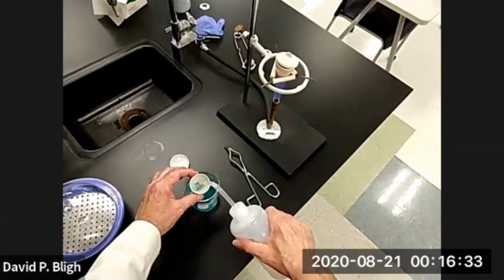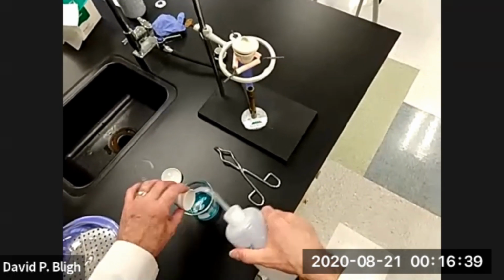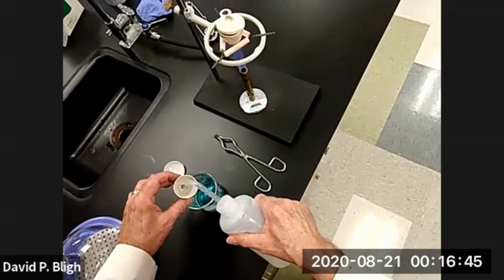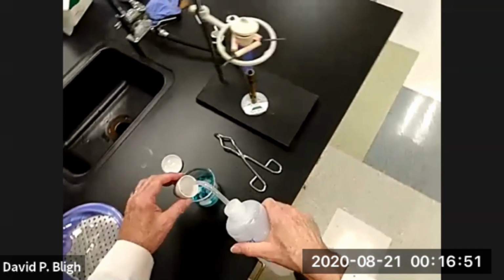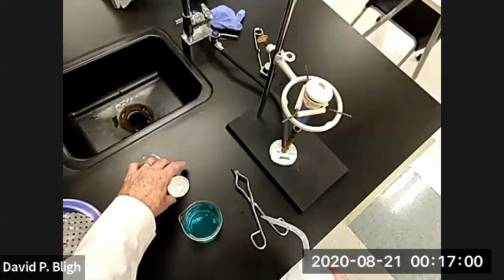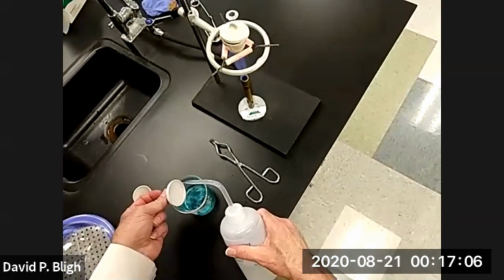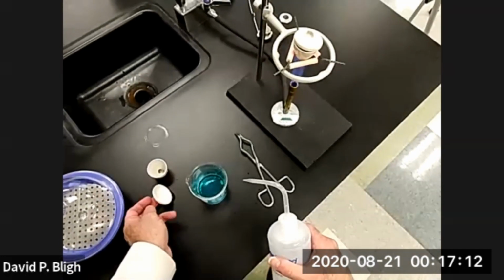All right. It's getting there. Oh yeah. Broke it loose. Okay. Now, if you don't have any time, you can just set this out and let it dry. And we want to rinse the lid out as well. Set that aside for proper disposal.